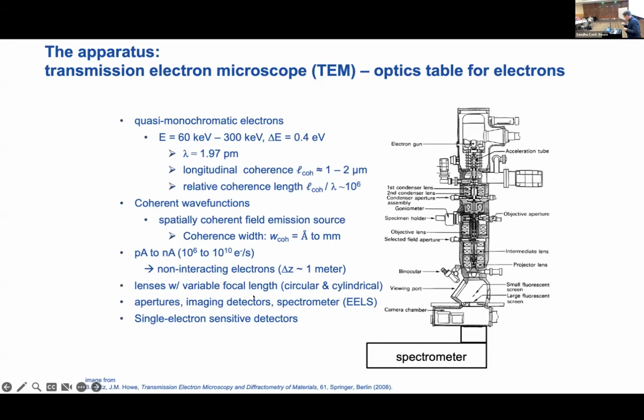The experiments that I'll show you, you can think of as single electron experiments done millions of times. There's many different kinds of lenses. So you can have round lenses. Again, you can tune those. There's aberration correctors. There's cylindrical lenses that you can tune.